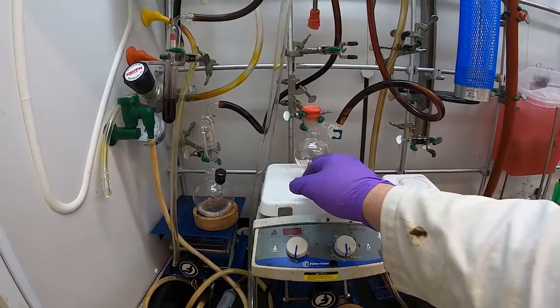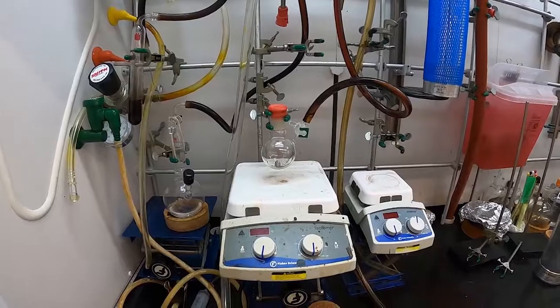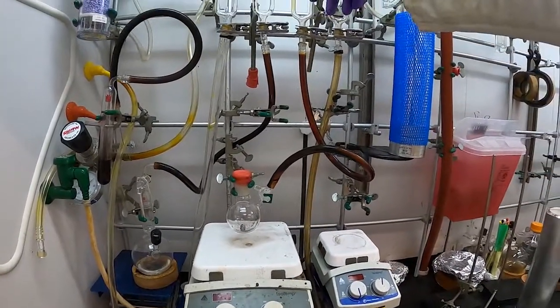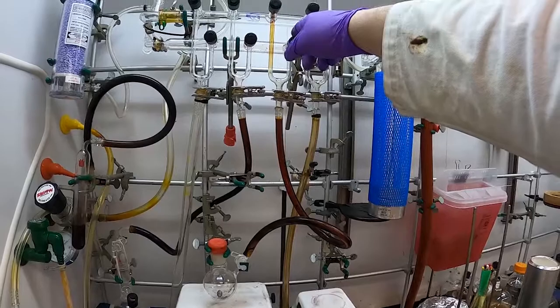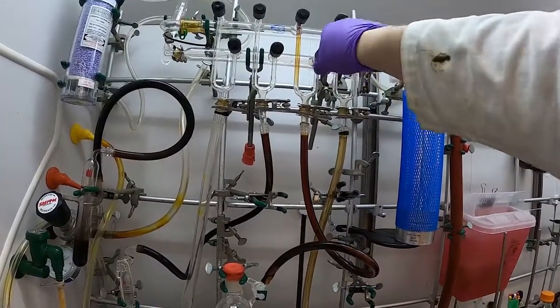The first thing we need to do is evacuate the inside of the flask, so that we can then refill it with our inert gas. So the first thing we need to do is open up our vacuum port here. So I have this connected to this port here. This is the vacuum port.